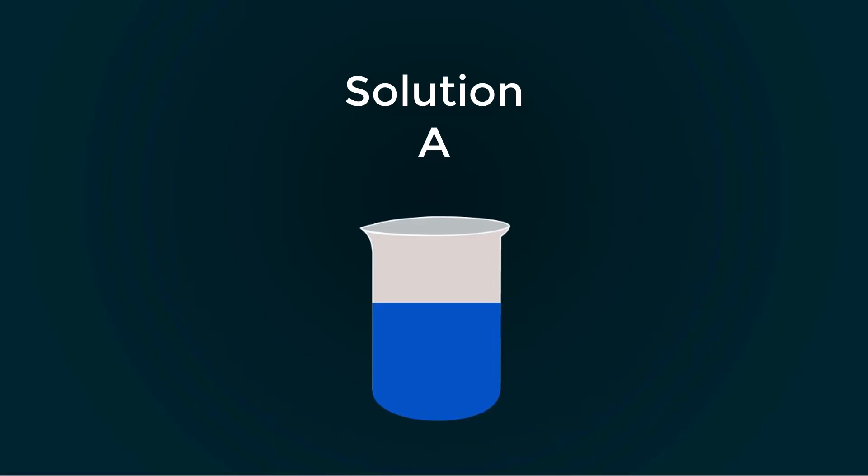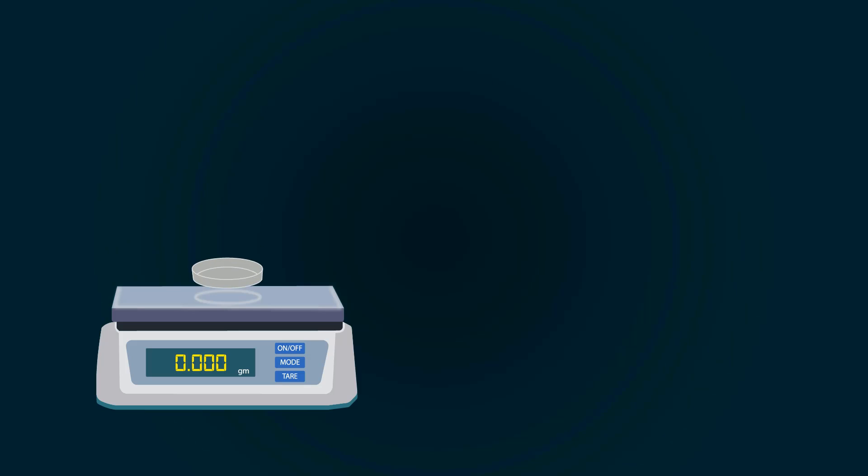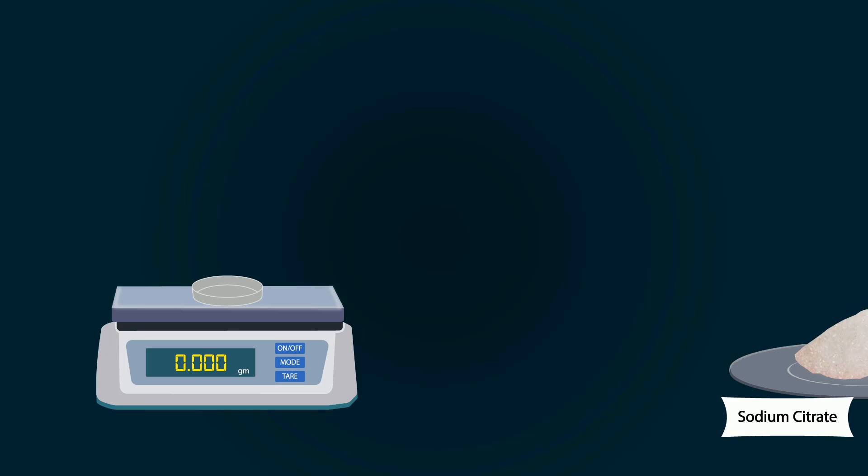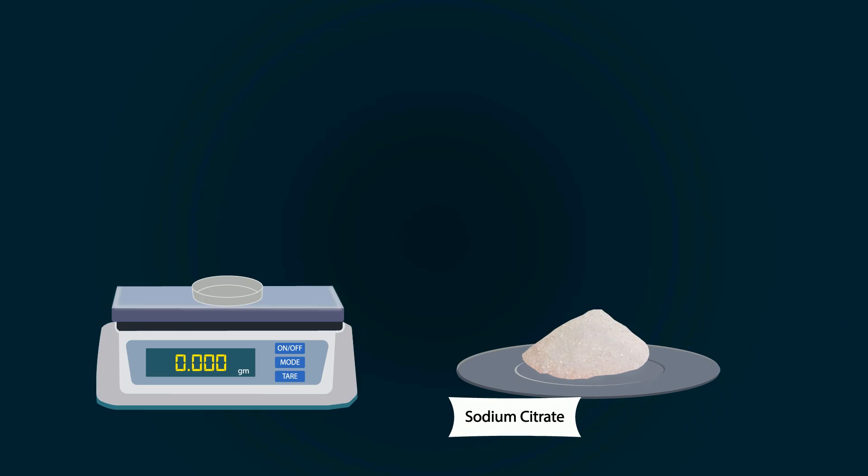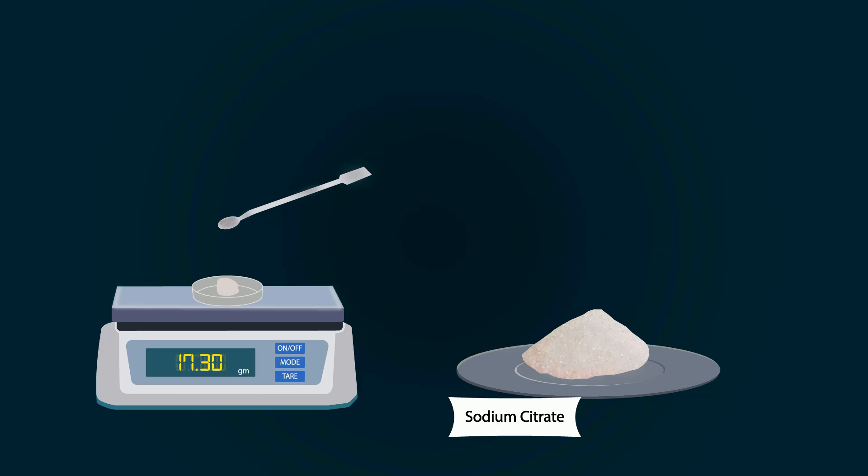You can call it Solution A. Take another petri dish and put it on the weight balance. Tare the weight balance. Take sodium citrate chemical from stock bottle. Put sodium citrate into the petri dish with a spatula. Weigh precisely 17.3 grams.